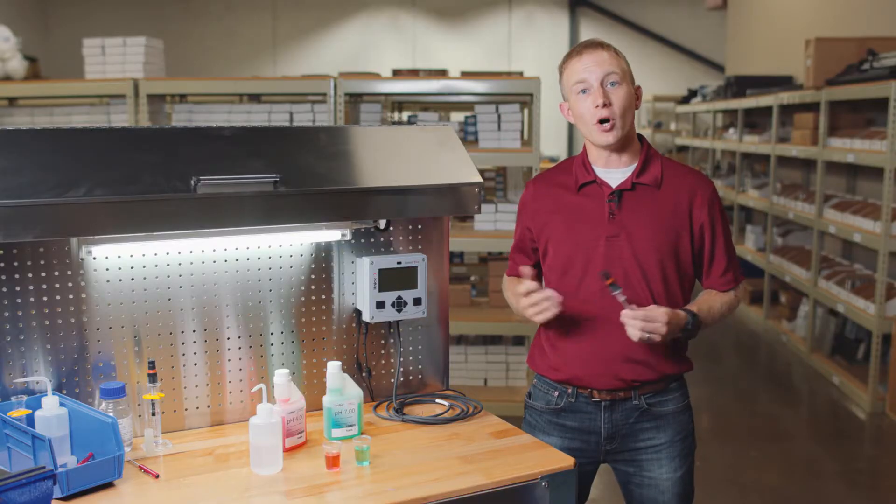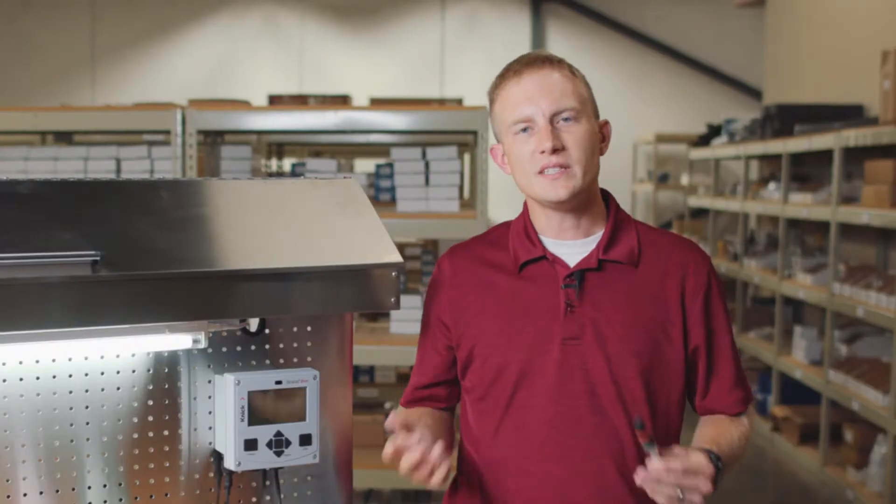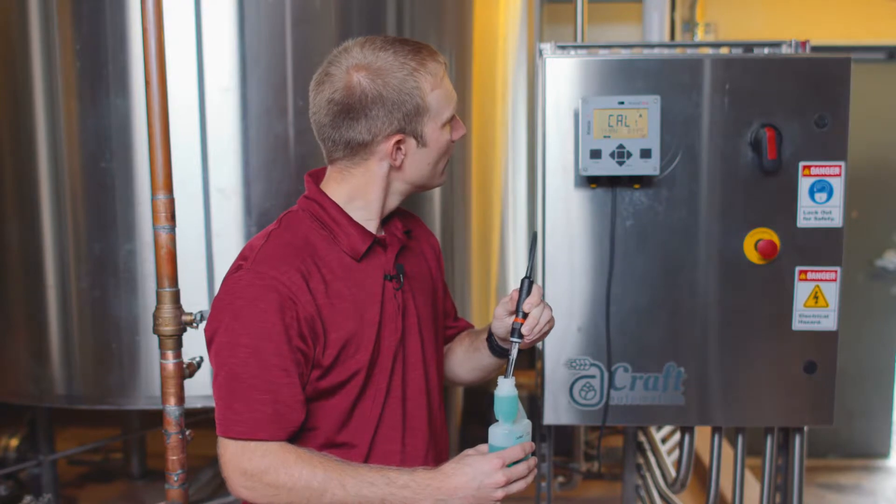We can now perform our calibrations offline in a controlled environment right here in our workshop. These same steps, however, can be utilized when performing a calibration in the field.